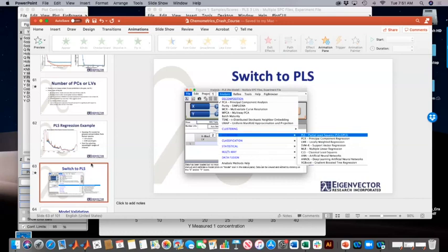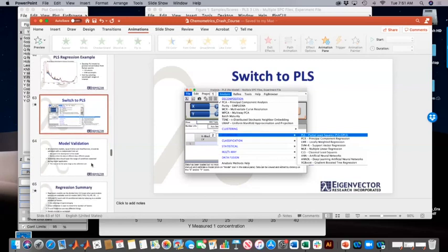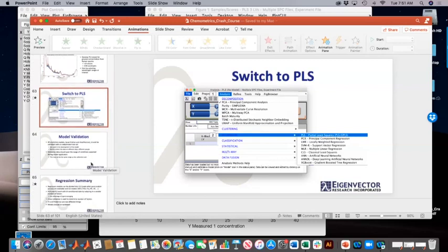And we had another question: is it safe to keep some samples with high scores to potentially encompass fluke samples later with a model that uses them? Yes, if you have some samples that are out on the extremes, if you think that your model is going to run into those in the future, then it would be a good thing to include them in the model.